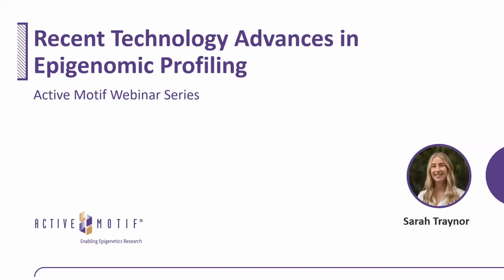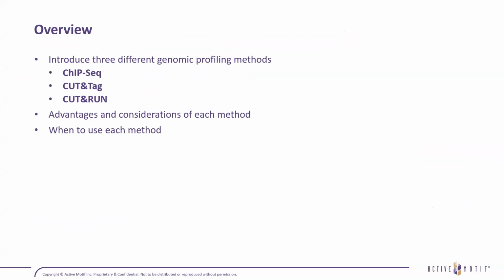I am Sarah Traynor. I'm a research scientist at Active Motif, and today I'll be talking about recent technology advances in epigenetic profiling, really focusing on three key methods that are offered here at Active Motif, either through kits or end-to-end services. So let's get into it.